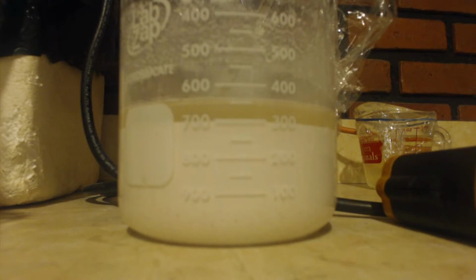My whole point is if you use magnesium sulfate, it might dissolve inside your pot, as you're putting the pot liquid through the magnesium sulfate to wash out the water, it is going to dissolve some of the magnesium sulfate. So you need something in there like molecular sieves, although the acid might destroy the sieves.